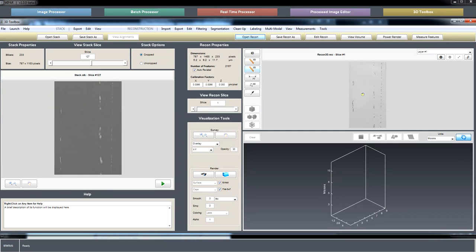Okay, so here's our volume. What we're looking at here is we just opened it up. Here's the binary segmentation. If you slide through here, those are the segmented features. We're looking at an XY view right now. Here's a cross view looking in the YZ and XZ direction. Here's the reference data slicing from the XZ.